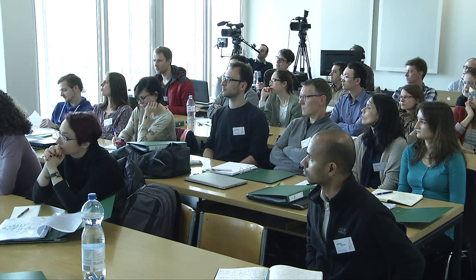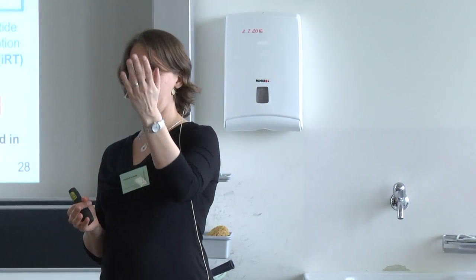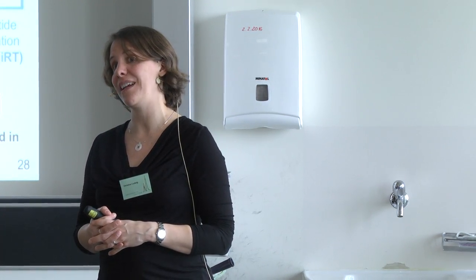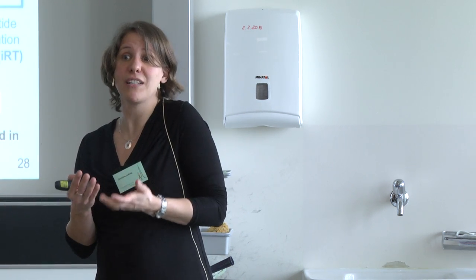You are depressingly right, definitely. So when you're targeting a protein that has never been detected before, or you're working with a PTM peptide that has never been detected before, the chances that you will be able to detect it are definitely low. They are not zero. And if it's a super important project, you might go for it.